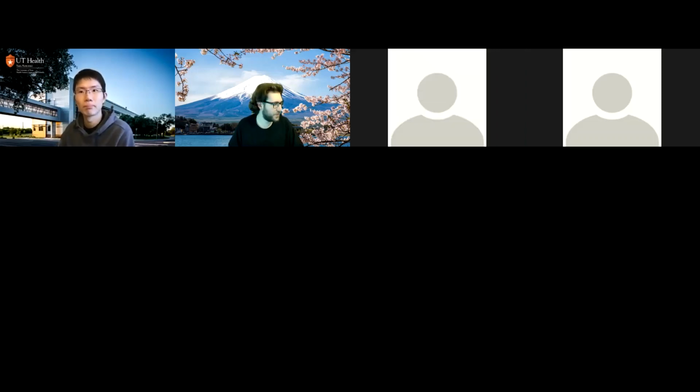Okay, so let's go ahead and actually get started now. Today's workshop is going to be a little bit different because we're actually going to be doing an activity together. And Chris, who is the postdoc in Dr. Chen's lab, is going to be walking you through how to actually use these virtual machines that we've set up and hopefully everyone's been able to connect to in order to actually process the raw sequencing data.